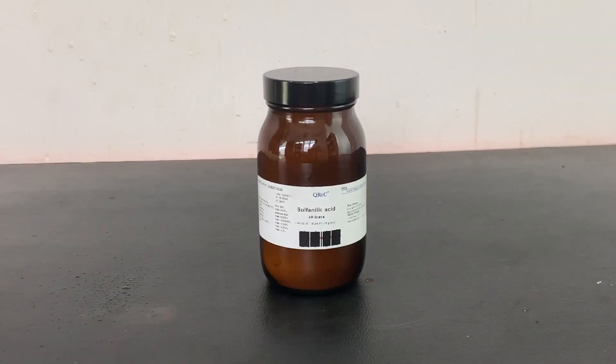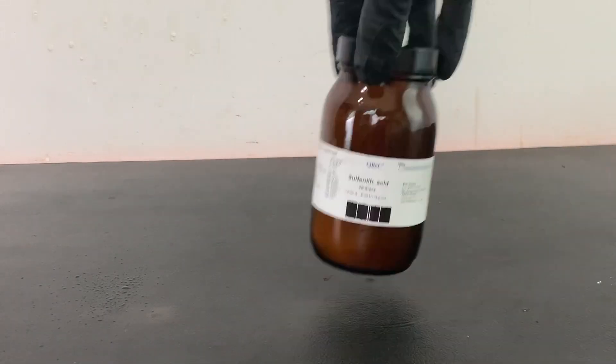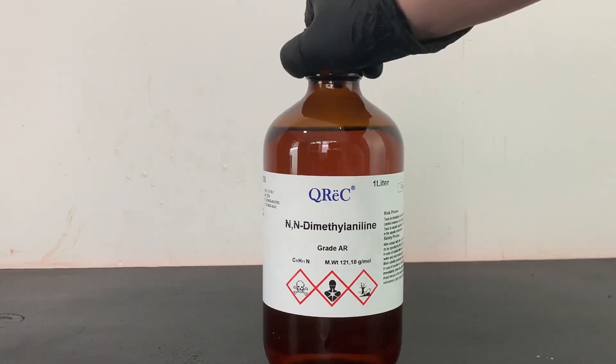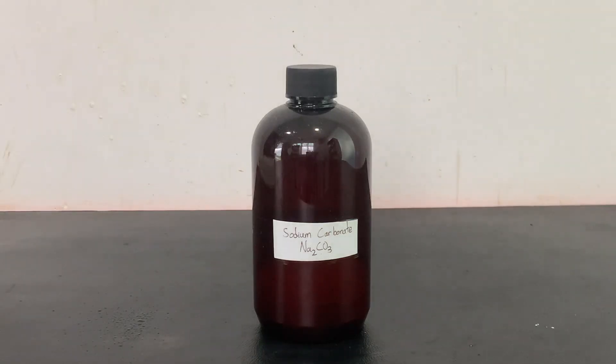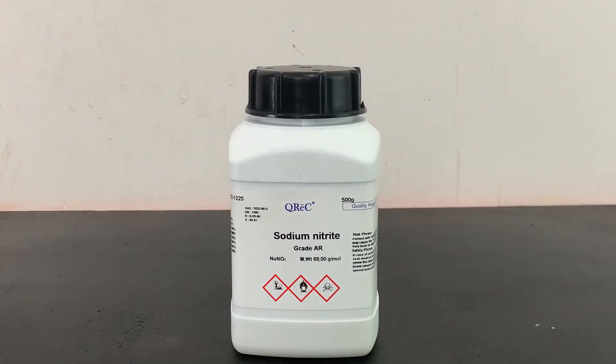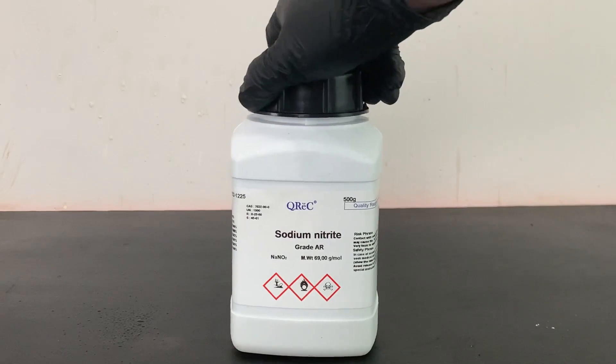To make the methyl orange, I used 3.6 grams of sulfonylic acid, 2.8 milliliters of NN-dimethylaniline, 1.2 grams of sodium carbonate, and 1.5 grams of sodium nitrite.